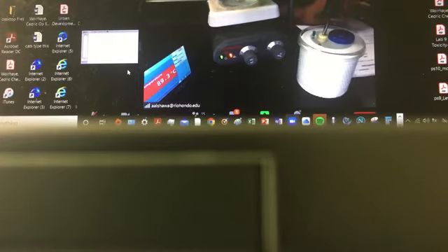So far it is changing. This is almost my 9 minutes, entering the 10th minute. But the temperature keeps on rising, so I want to see that temperature stay at the same value for at least a minute. Then I'll scoop it out and dump it inside that water inside the calorimeter.